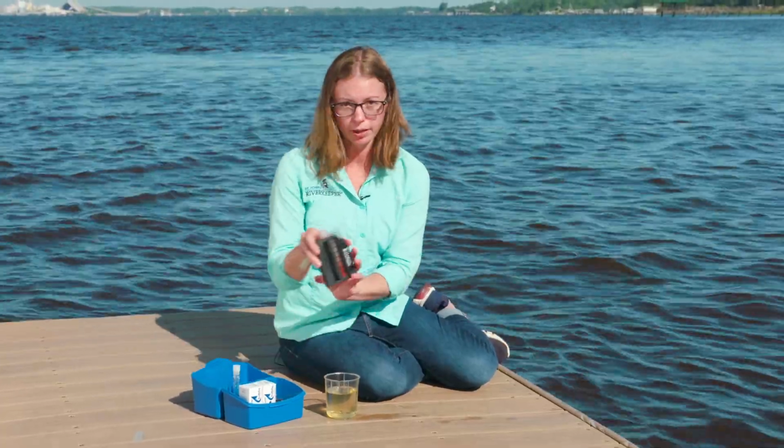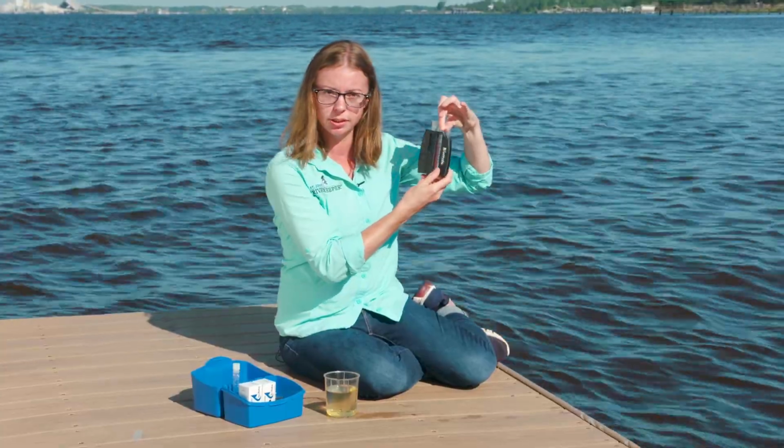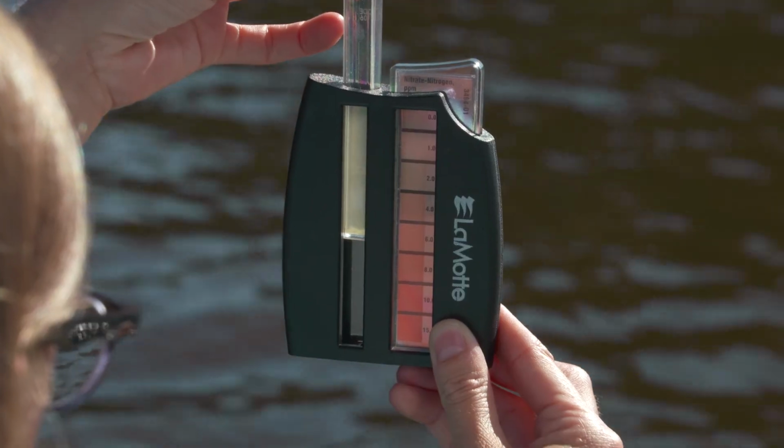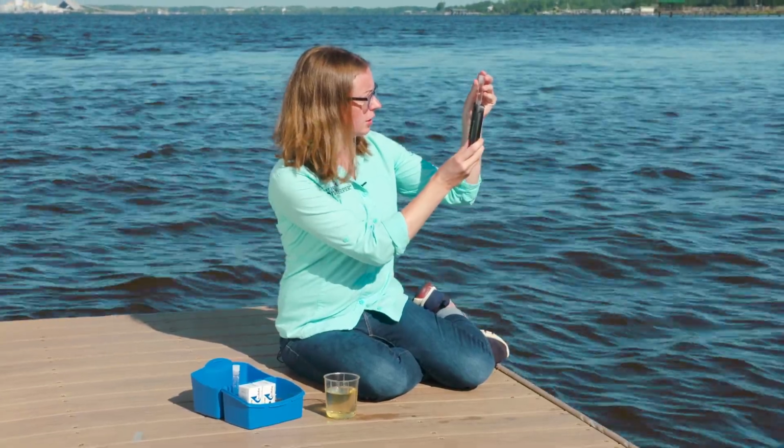I have a color comparator. I'm going to put the vial in one side, and then I have a color chart on the other side. So I'm just going to take a look and see what our levels are today. And it looks like our nitrate levels is about 1 ppm.